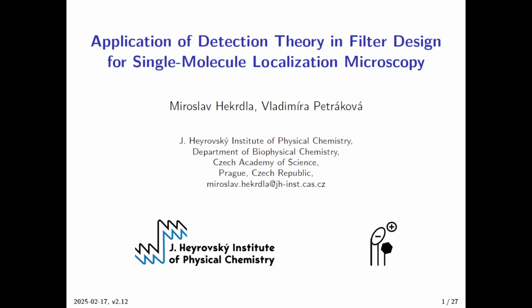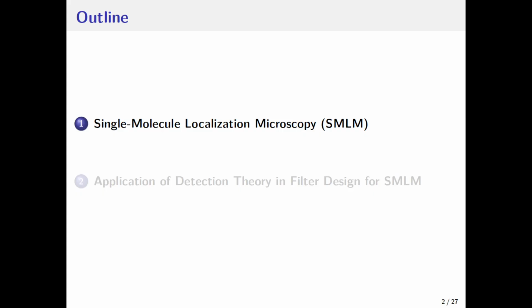The talk is divided into two parts. In the first part, which is the introductory part, I will repeat some basics about single molecule localization microscopy, SMLM. In the next part, I will talk more about the content of the article.